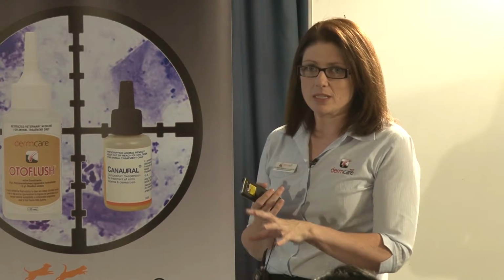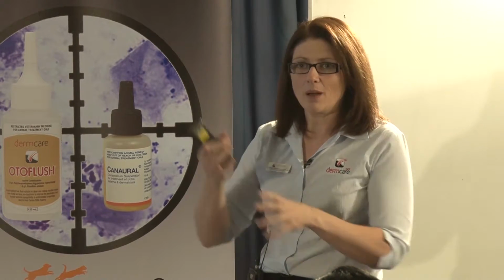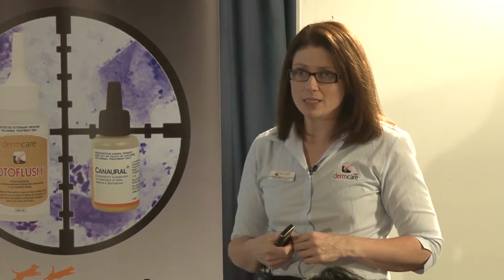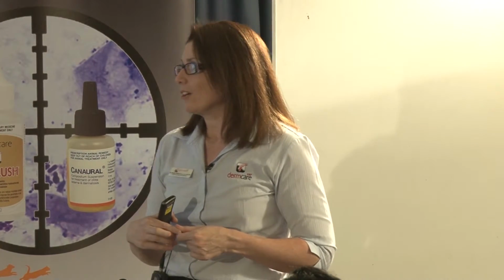The first bucket is just water. The second bucket is Malaseb and water, and the third bucket is just water. And we simply dunk them rather than trying to use running water. So it can be done quickly. The ideal contact time, of course, for Malaseb is 10 minutes. Contact time is important with the effectiveness. However, there are good results even at shorter time frames than that.